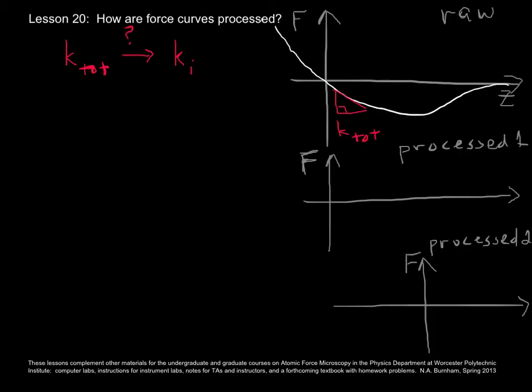We tell our computer to take advantage of the equation that I wrote a few slides ago, saying the distance between the cantilever holder and the sample is equal to the sum of the cantilever compression or extension plus the distance between the cantilever and the sample.